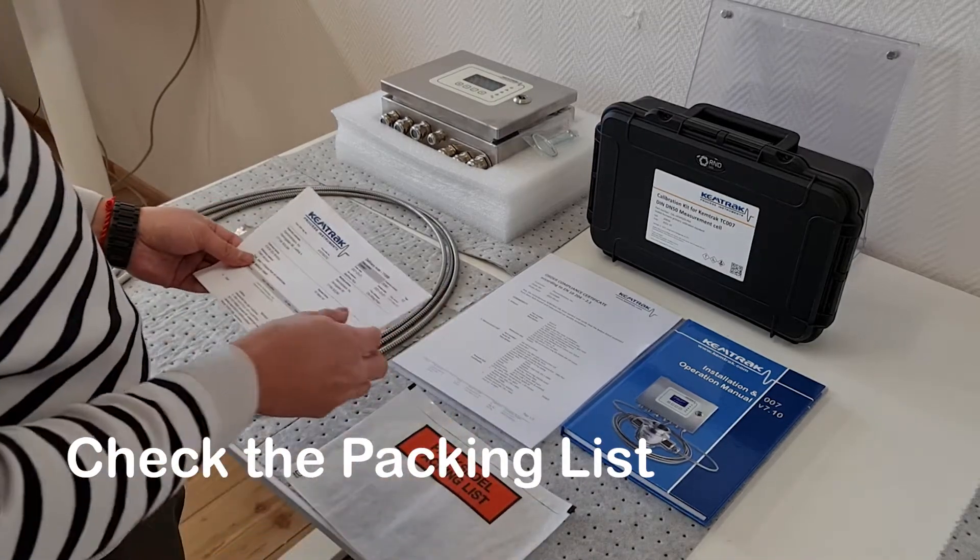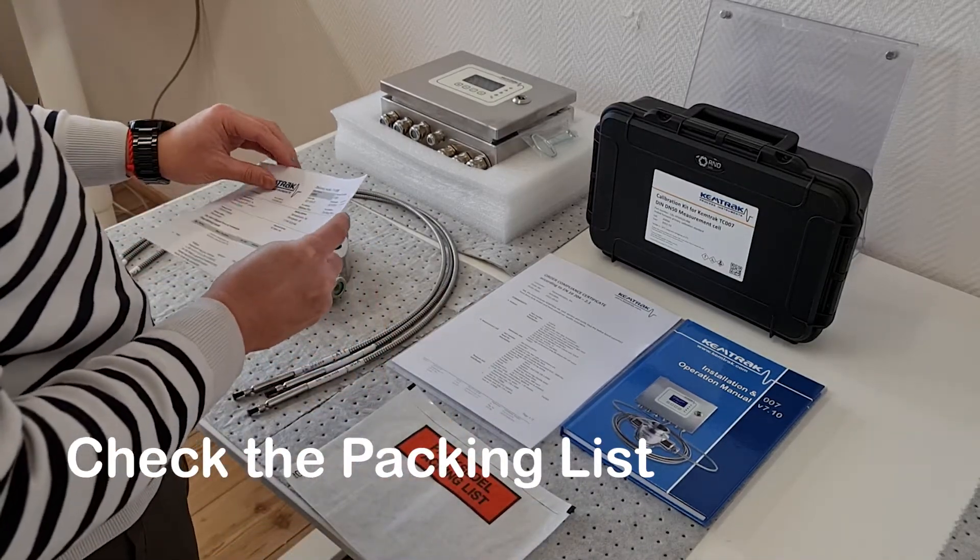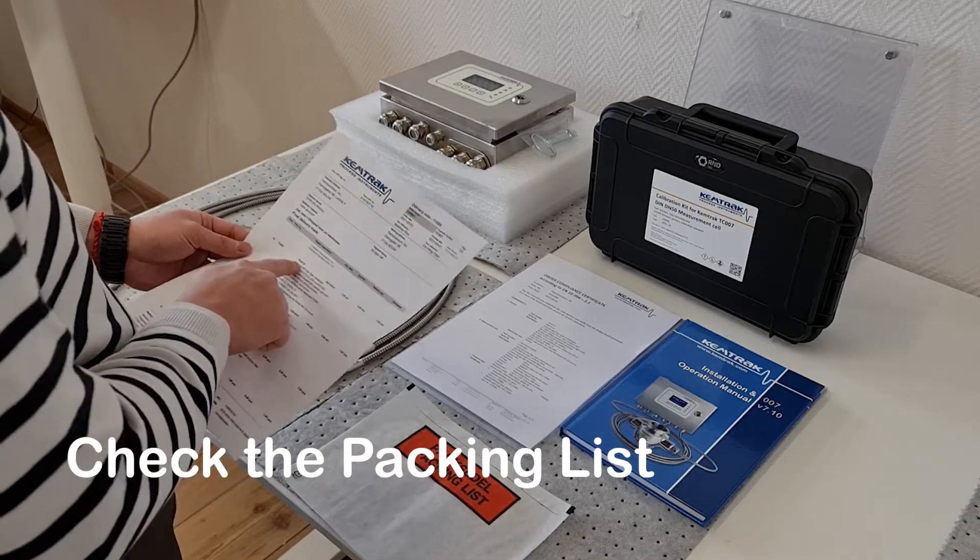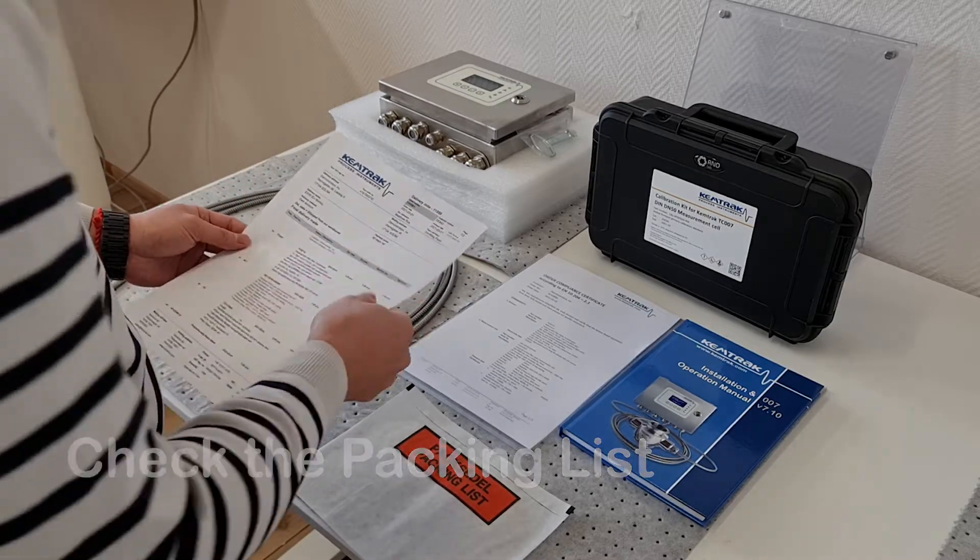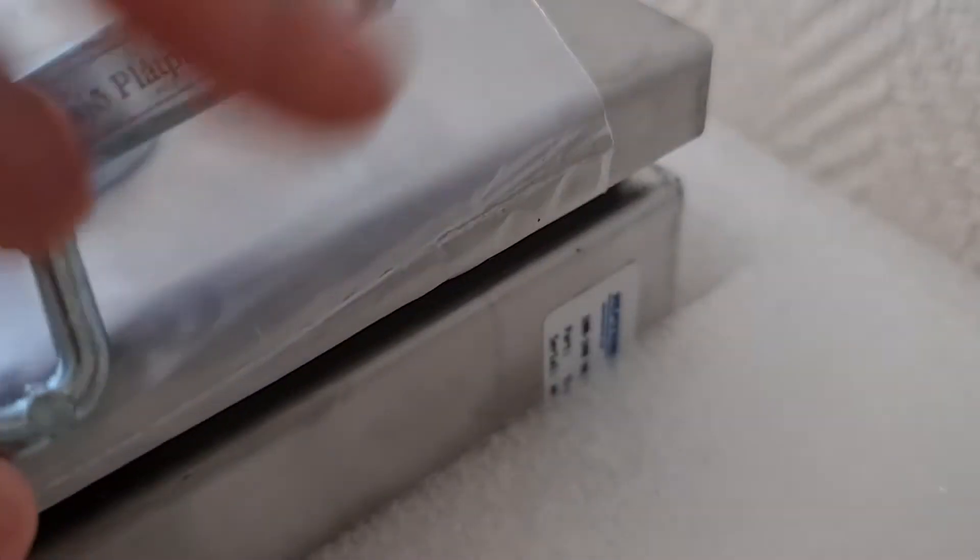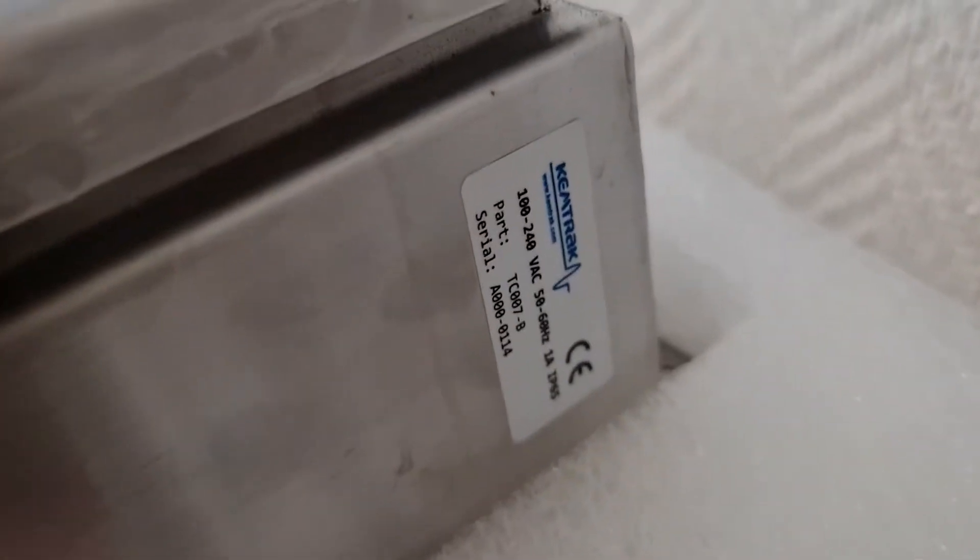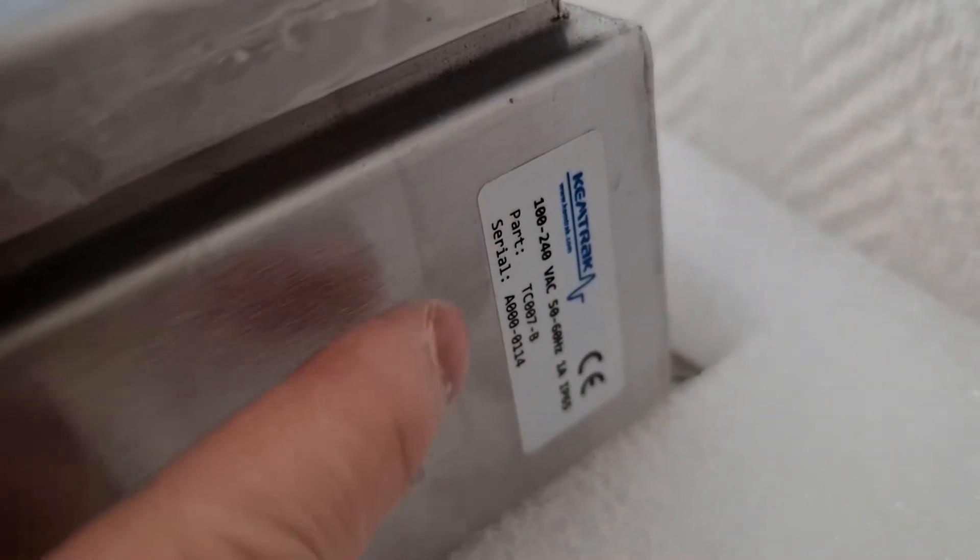Start by confirming the items received match the items listed on the packing list. The first item to confirm is the analyzer. The part number of the analyzer is located on the side of the enclosure.